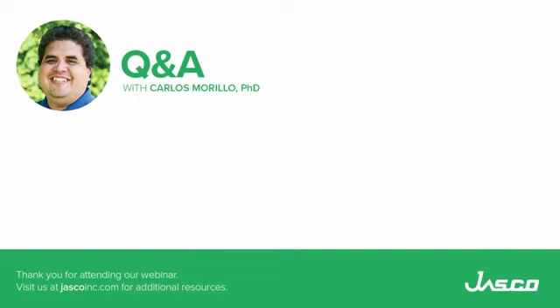I think that the color is just overlapping a little with the green, but actually there are only two components. And I'm going to point here with my mouse. It's just to say MCR score 1, MCR score 2.